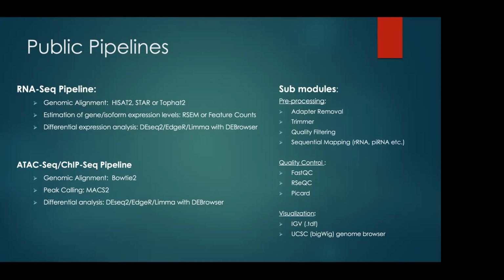And we are reusing these modules again and again inside the different pipelines. For quality control purposes, for the raw reads, we use FastQC to see any kind of problem inside our raw reads.